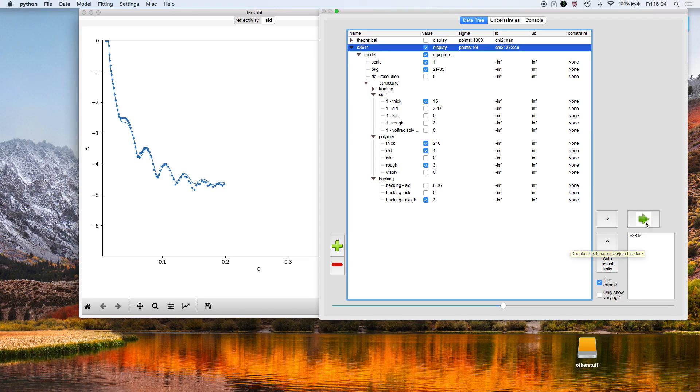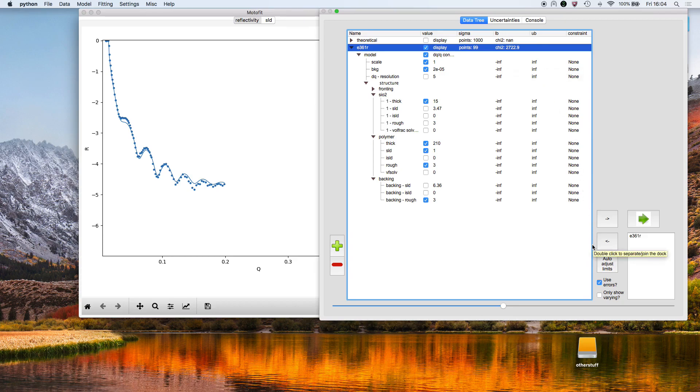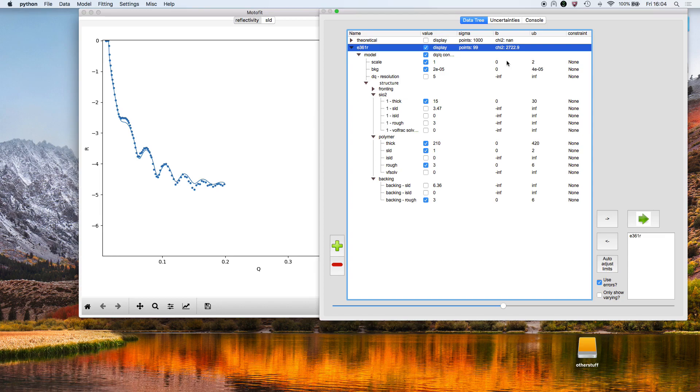Now what we need to do is set the lower and the upper bounds for the fit. A quick and easy way of doing that is to click on auto-adjust limits, and it's set up default limits for the lower and upper bounds for the parameters we're fitting. You then press go.